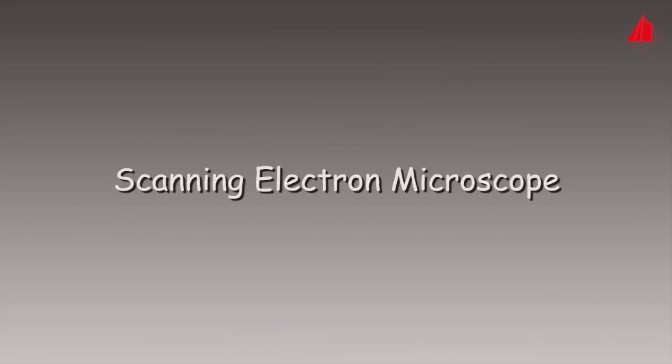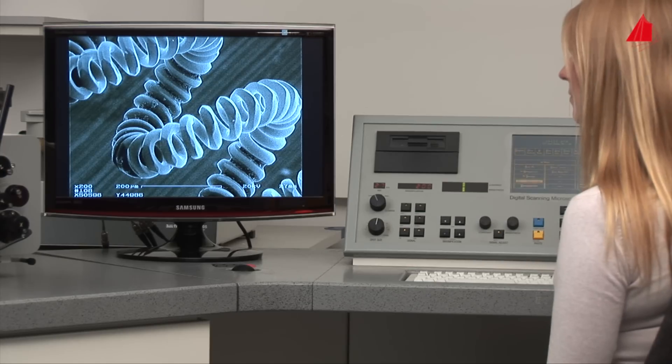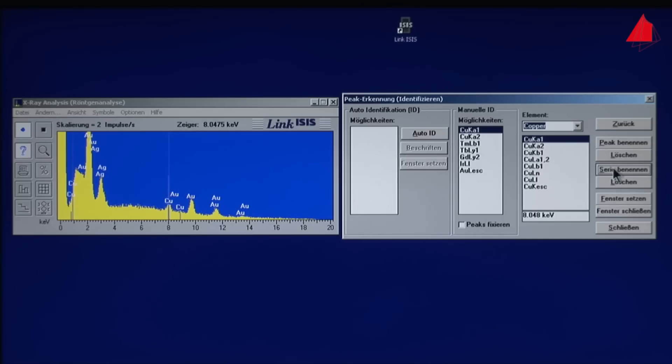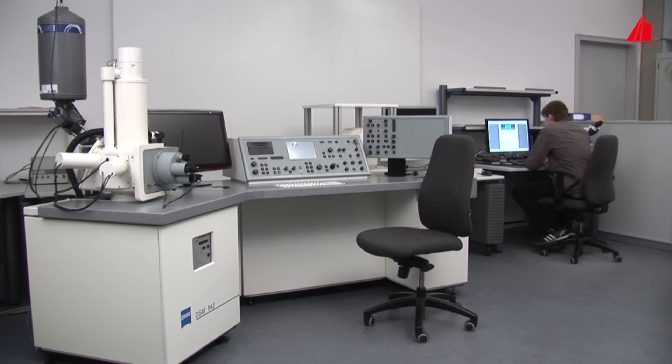The scanning electron microscope — scanning electron microscopy — is one of the most fascinating examination methods. This video shows how it works in practice. Main components of the microscope are the column for electron beam generation, specimen chamber, vacuum pump, monitor, and control panels.